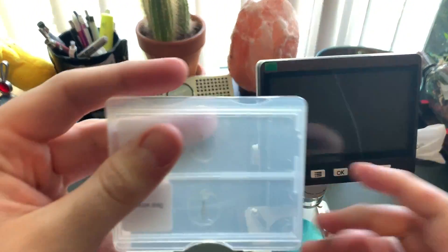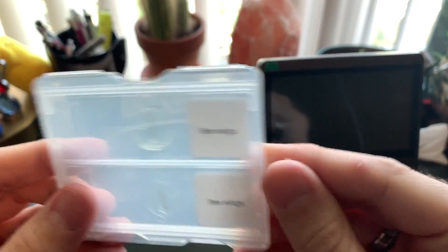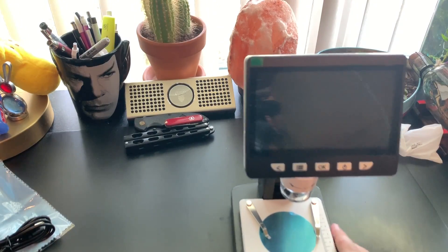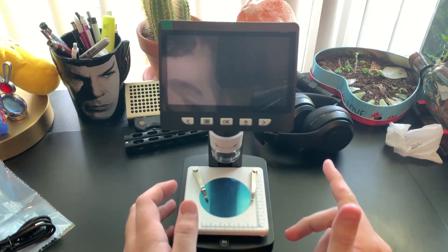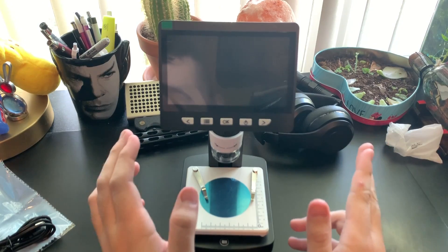You also get some sample bee wings in here so we can test it on the microscope. Setting that aside, let's get to the microscope itself. As I said, it has a built-in battery at 1500 milliamp hours, records 1080p digital, with 50 times to 1000 times zoom.